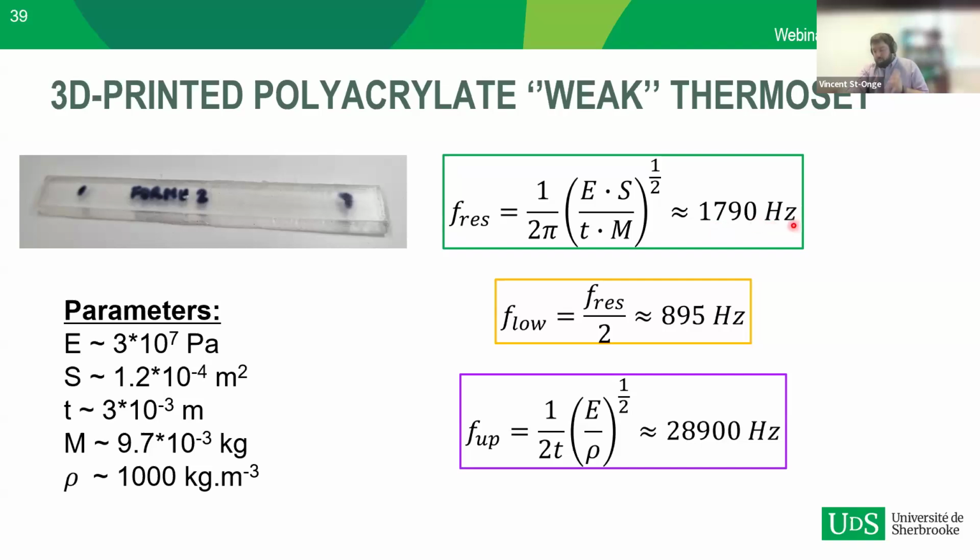for your resonance frequency. For sure, we can play on the thickness of the sample and on its size and also on the mass we put on top to try and shift the resonating frequency down to lower frequencies. But they still present quite a challenge to analyze with the instrument.